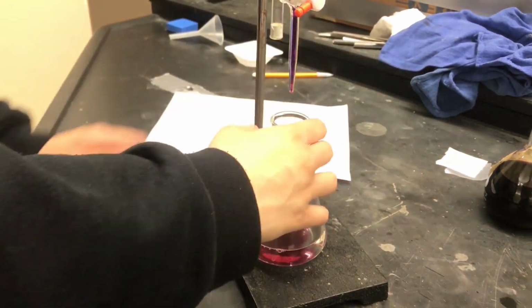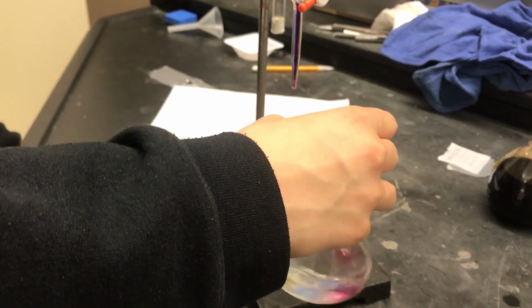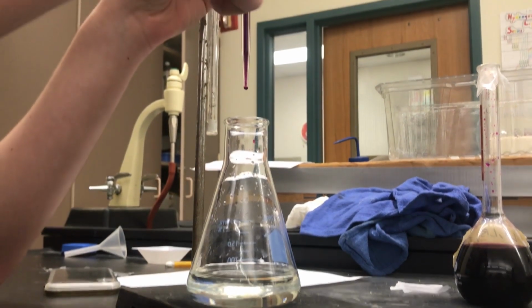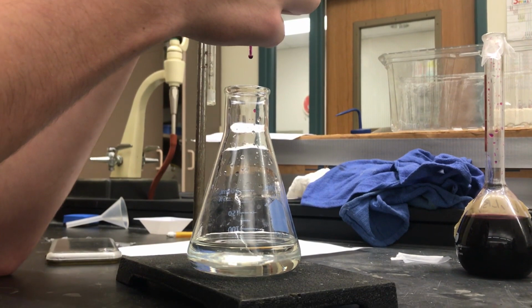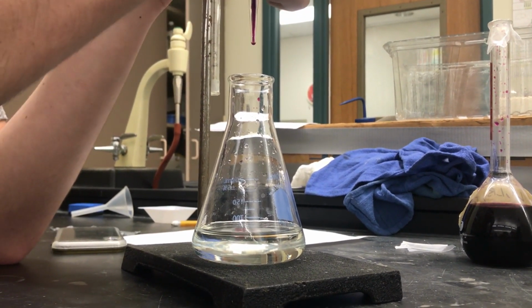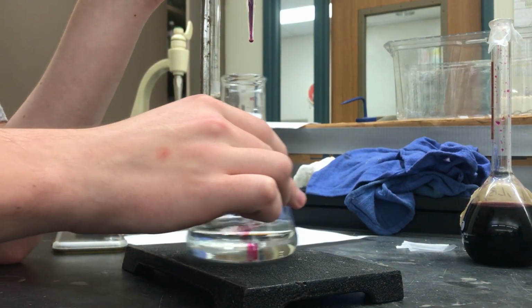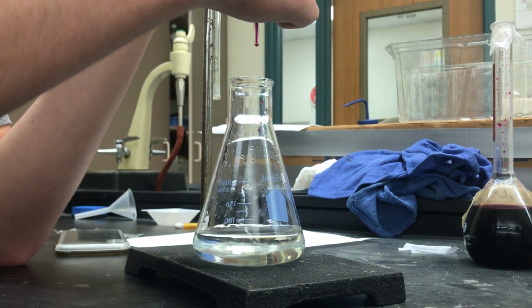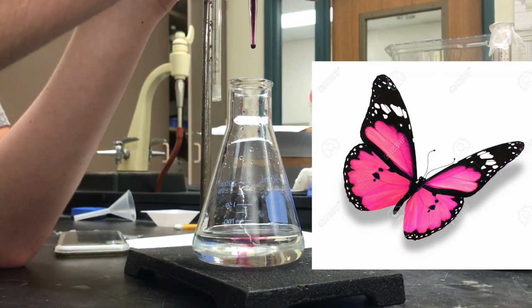So we're not very close to the titration point. Well, now we are. Now that we know we're close, we're going to start adding a drop at a time and swirling each one of those drops. You want the color of your solution to be a butterfly pink.